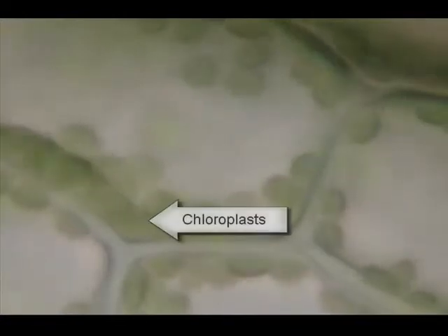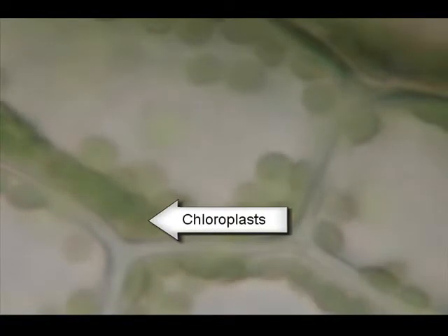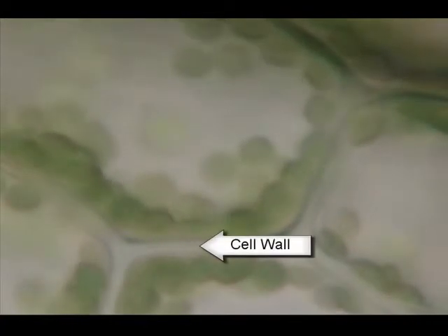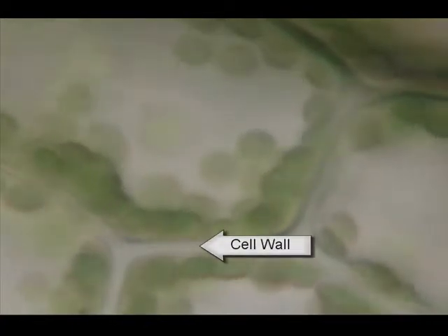As you can see, the leaves are alive with activity. Let's take a closer look at one of these leaves. The green objects in motion are chloroplasts, the site of photosynthesis. Other structures include the cell wall and the central vacuole.